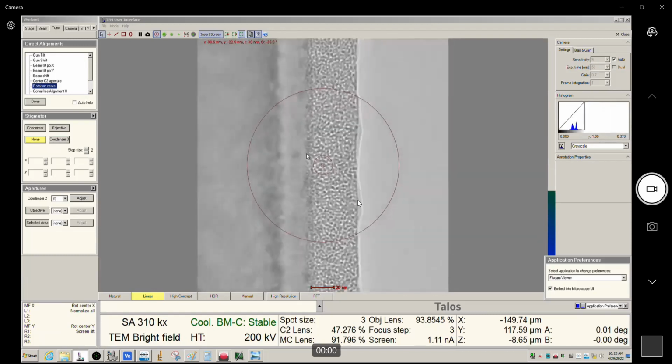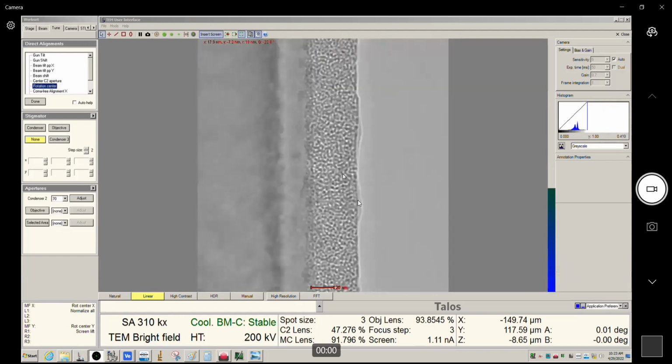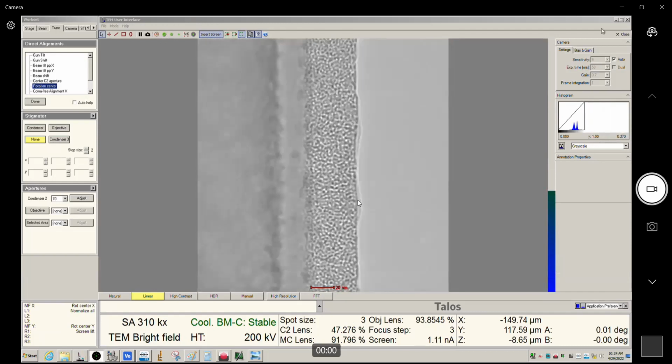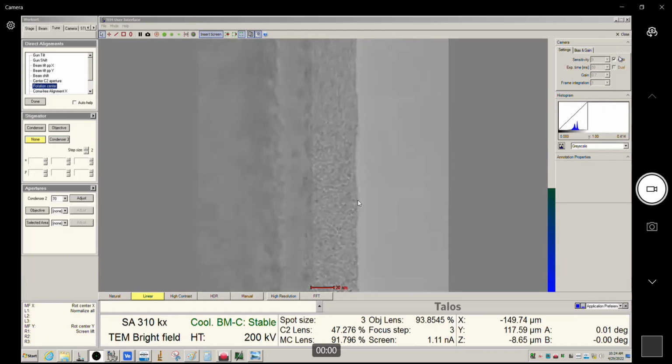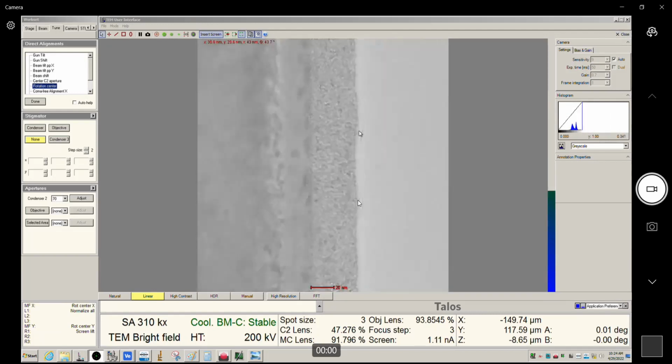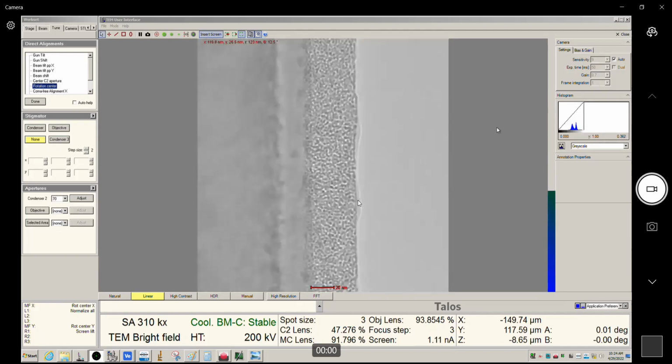And this response is not too bad. I'm going to turn this off. You do have the ability here. Sometimes the flucam makes these on-the-fly adjustments to its exposure time, and those are usually pretty helpful, but sometimes this ends up defaulting to something a little too slow. So you always have the ability to manually fudge this.